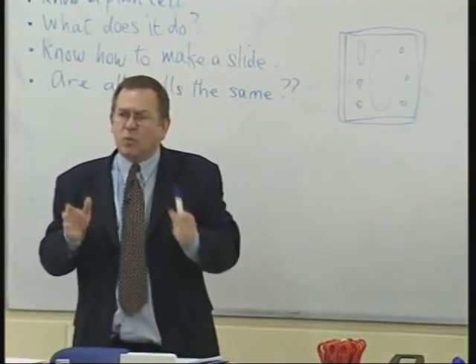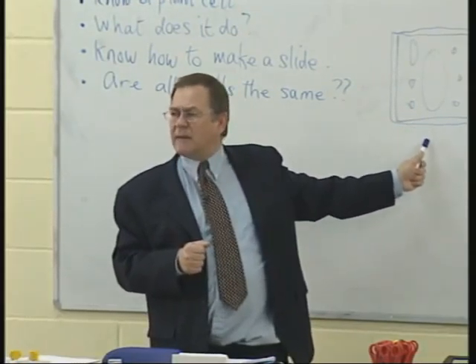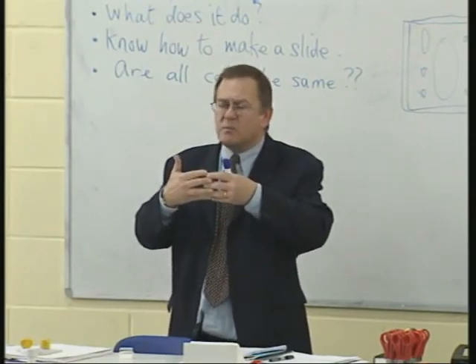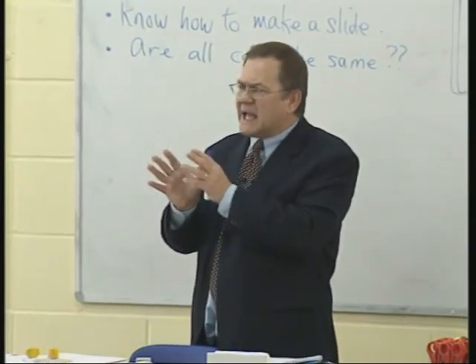other shapes. Very good. So what we are saying is, that is a diagram. But what you're looking at is real life. Everything's not perfect in real life. Can anyone describe what they were like? You could see the cells, that they were all spread across. They weren't in a proper shape, they were in all different kinds of shapes. Very good. Can anyone add something to that?